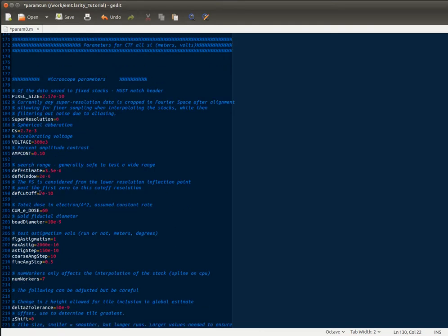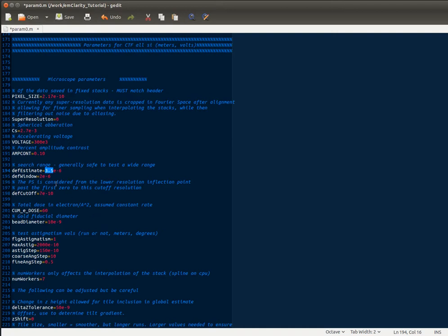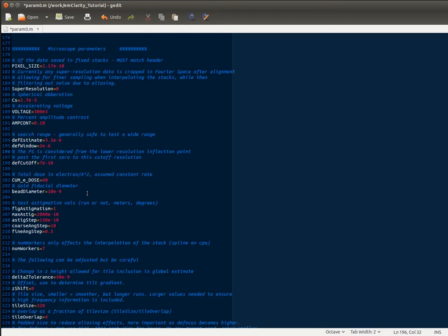The defocus estimate is generally pretty robust. However, you want to get it reasonably close. An important thing too is to make sure that the defocus window doesn't go negative, but there is a catch in the code to handle that. So for the reliant data set, 3.5 micron plus or minus 2 is generally sufficient. Defocus cutoff is how far out the CTF is fit. So for tomography data, 7 to 8 angstroms is generally pretty sufficient. Unless you have really clean, good data, you could go further. And that's discussed in the CTF estimation video, how to choose that. The cumulative electron dose is your total cumulative dose summed over all projections. So in this case, it's 60 electrons per angstrom squared.